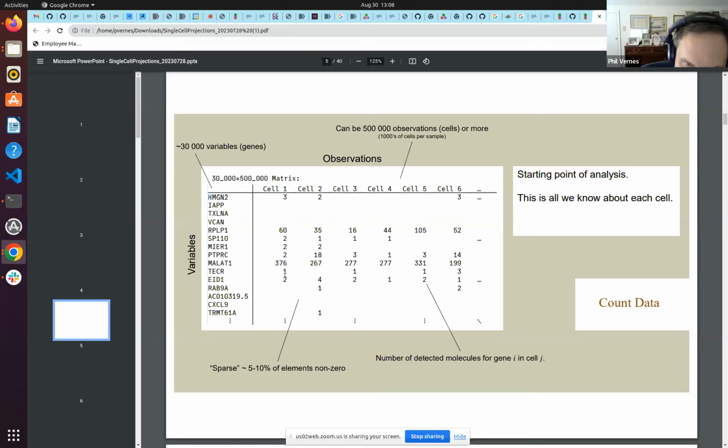All these numbers here only represent counts. So if you look at it, you say I have a gene and I have a cell. This is a sample, right? This whole thing's a sample, and there might be multiple samples in my data sets. In which case, you have a sample ID like P1, P2, etc. In this case, let's just not worry about that.